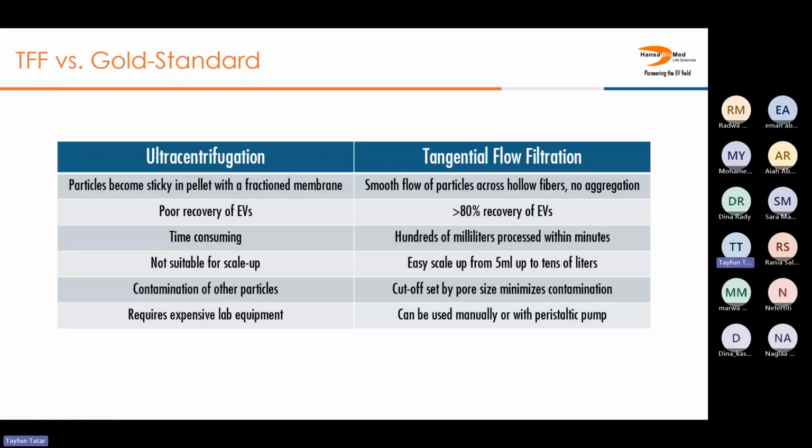And of course, the most straightforward approach to understand what benefits can be gained from tangential flow filtration is to compare it with the gold standard, namely ultracentrifugation.